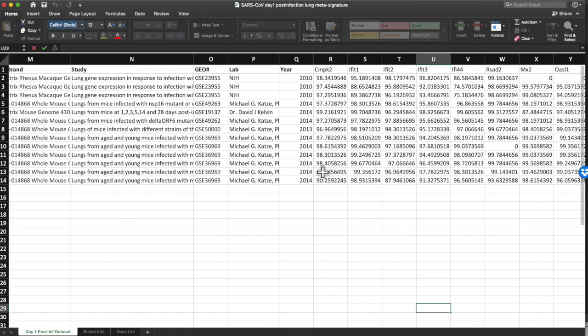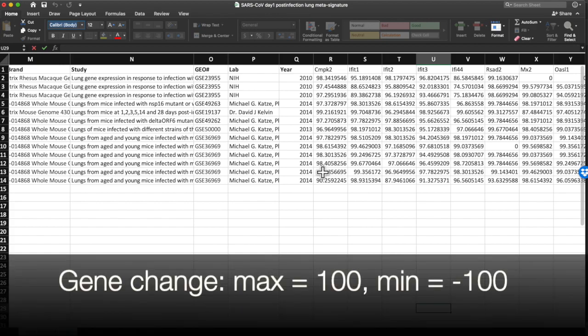We modified these scores to reflect the direction of change so that all Illumina scores signifying a change in expression below control levels were made negative, while all genes with an increase in expression remain positive.